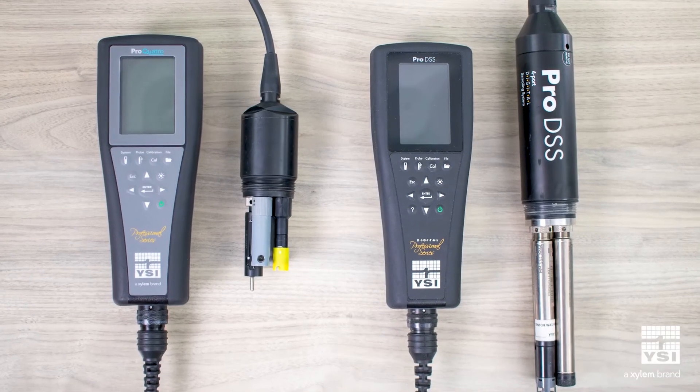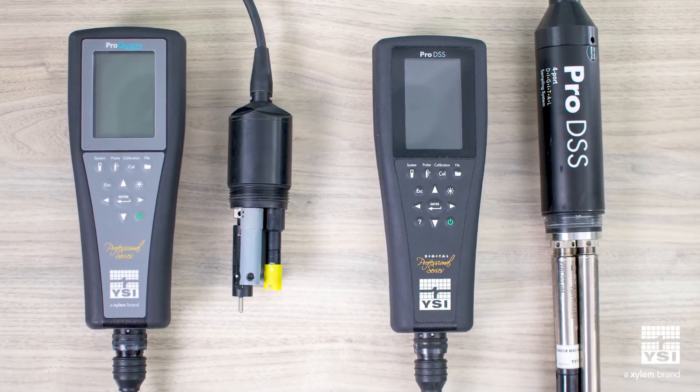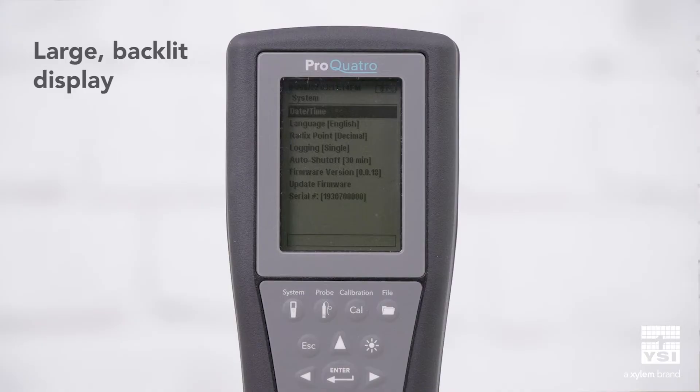These handhelds are easy to operate with a menu-driven interface and convenient keypad to quickly navigate the most common features. Readings can be easily viewed on the large backlit display screen, even while wearing polarized glasses.